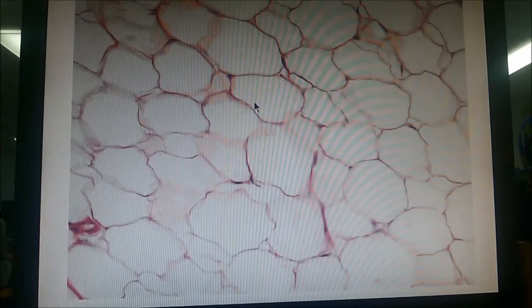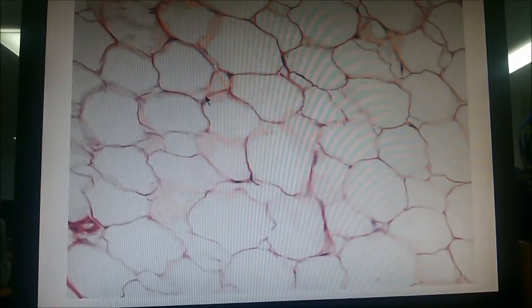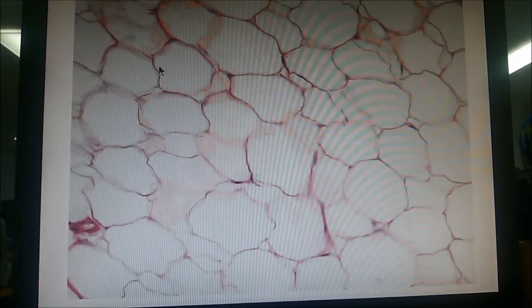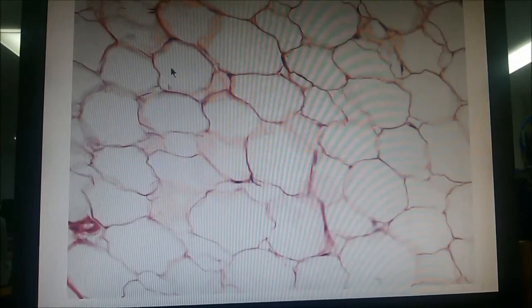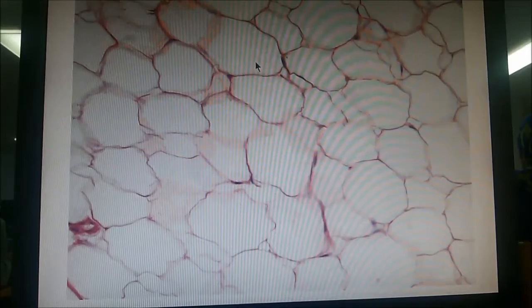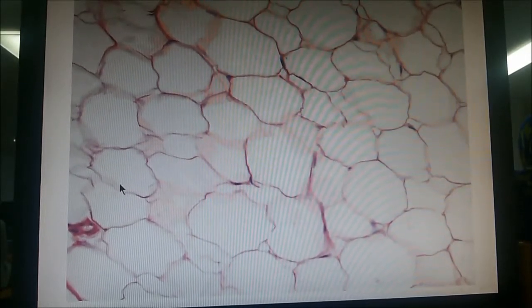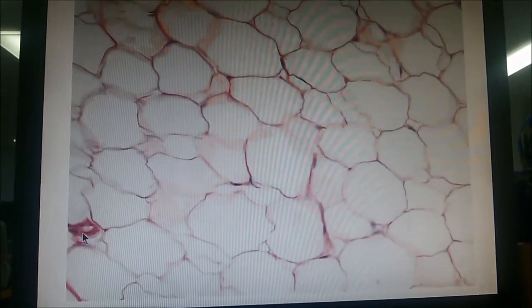Over here you see some shrinkage of the cells, okay, a little shrinkage of the cells, so their borders are wrinkled. The plasma membrane has wrinkling. Of course, white adipose, empty cells, and the nuclei are extremely peripheral. The signet ring appearance. Over here, what is this? Yeah, it's a blood vessel, it's a capillary. That's right. What do we see here also? White adipose, with a little shrinkage.